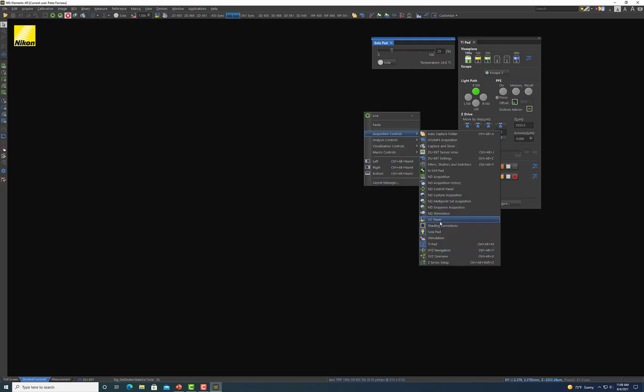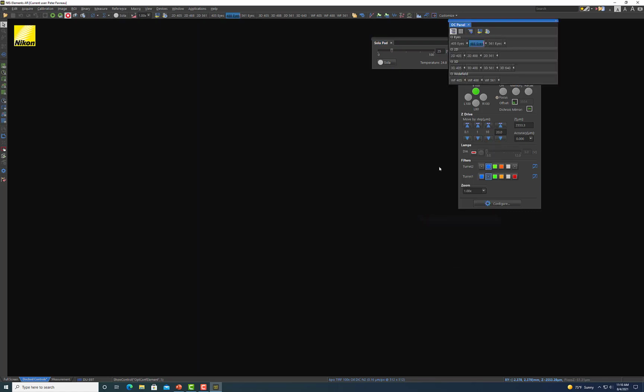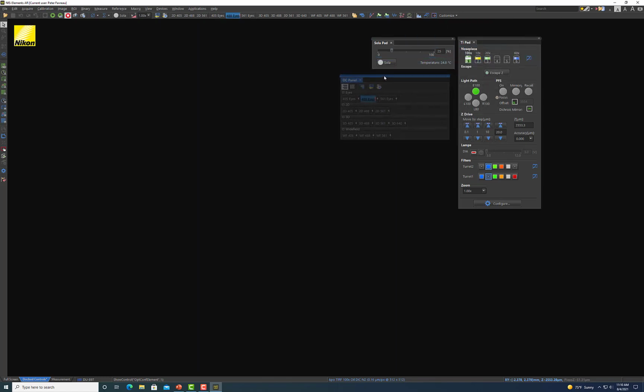Another thing I'm going to draw your attention to is just our OC panel. I did an entire video on optical configuration, so view that video if you want to learn how to make an optical configuration, which is essentially just a preset. Right here I have a number of presets I've made for my own personal imaging. You see I have presets for just looking with the oculars, so this would be the epifluorescence mode. I have two different SIM optical configuration panels here, one for 2D imaging, which I'll get into in a second, and one for 3D imaging. And finally, just for gut checks, I like to have a wide field set as well.